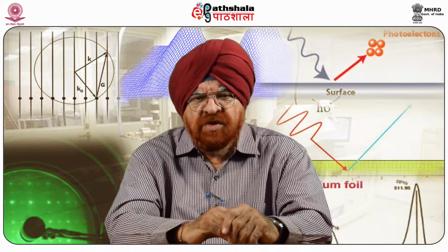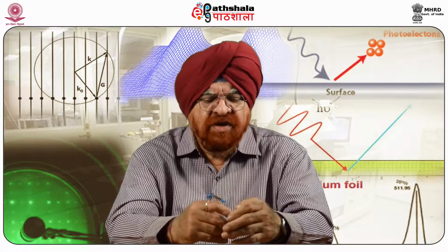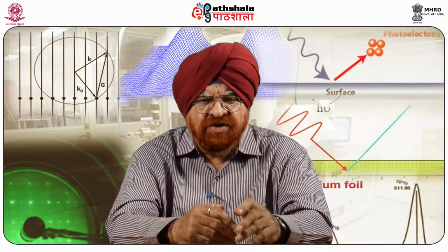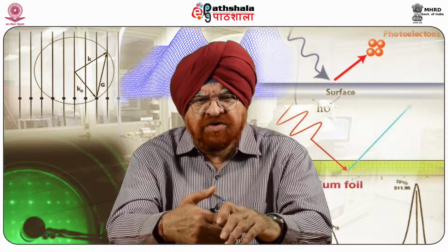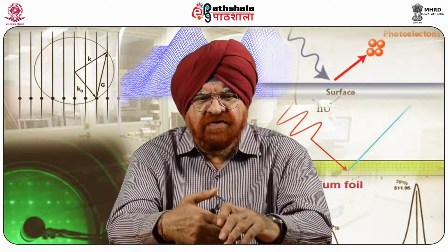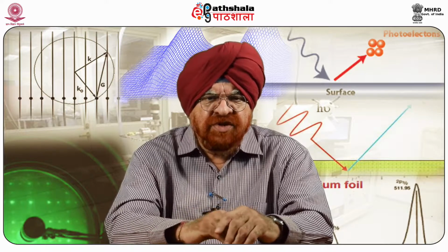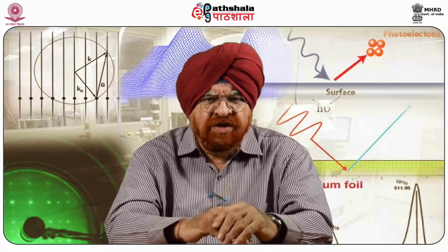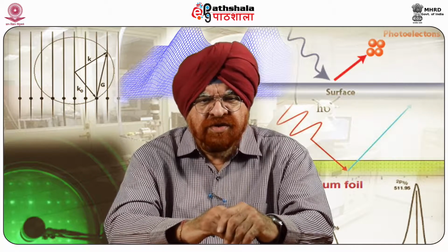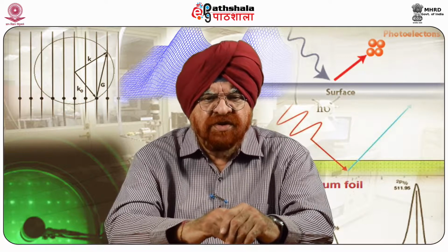So students, having learnt about magnetic force microscopy from the point of view of introduction and instrumentation, one can now summarize what exactly we have learned in this particular module. MFM is a relatively new technique for imaging magnetization patterns with high resolution and minimal sample preparation.